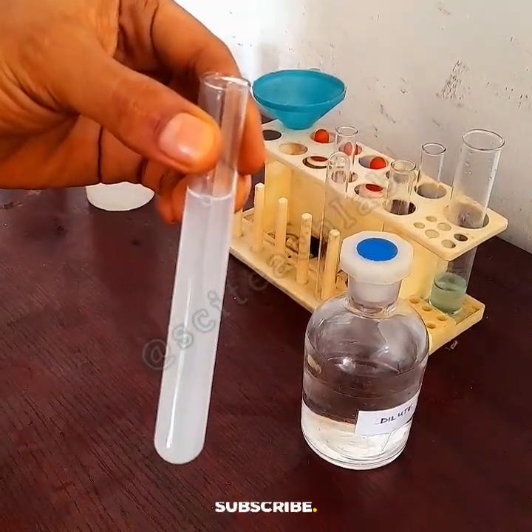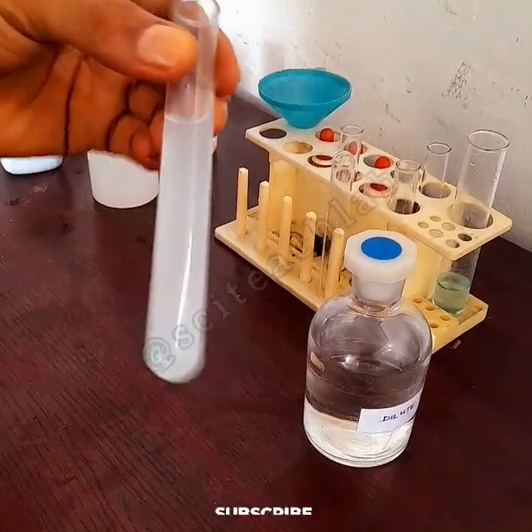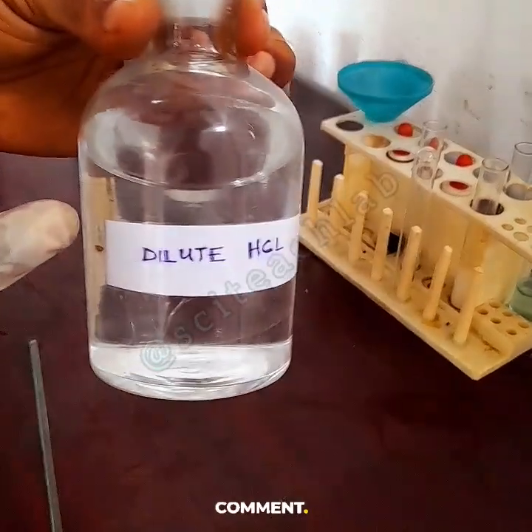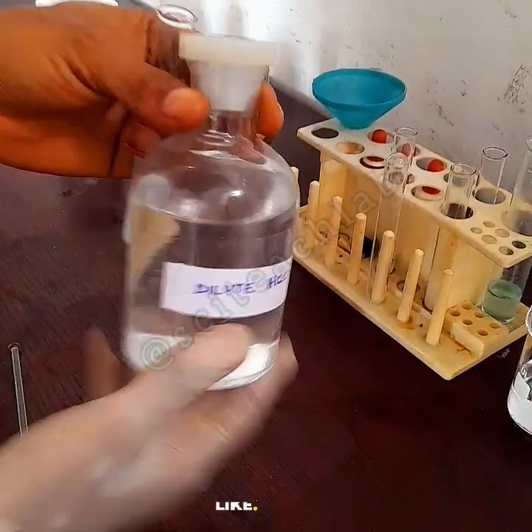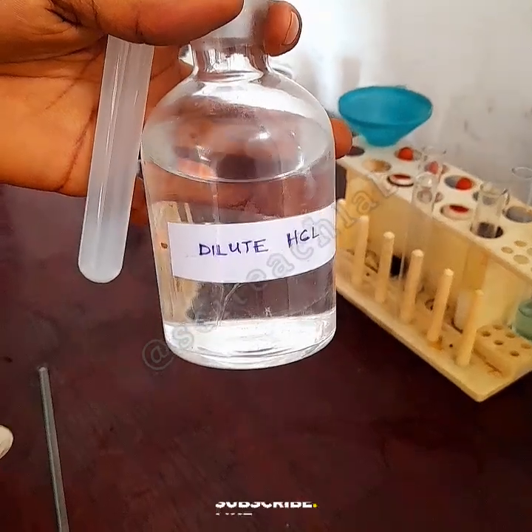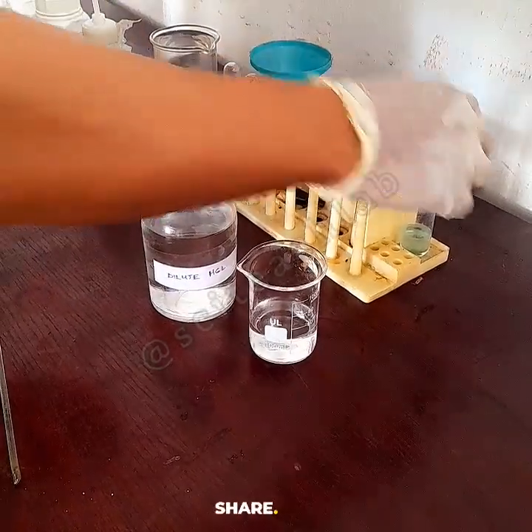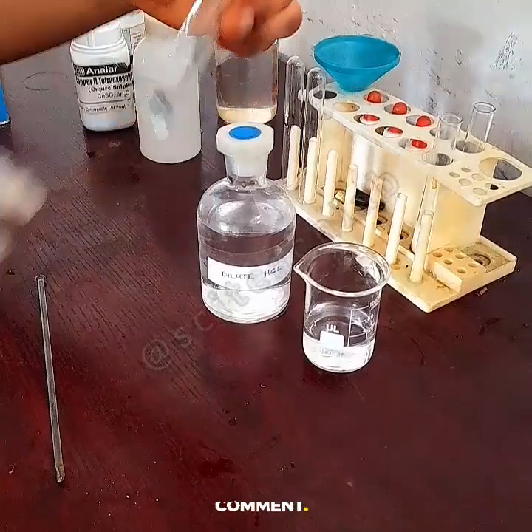It shows me that something is present, and that thing is the sulfate ion. Sulfate ion SO4 2- does not dissolve in excess hydrochloric acid and barium chloride. So if it's a sulfate ion, it won't dissolve, and we found out that it's a sulfate ion. That's why it didn't dissolve.